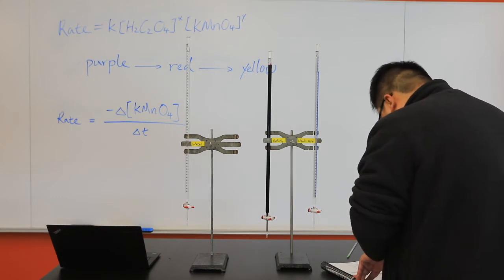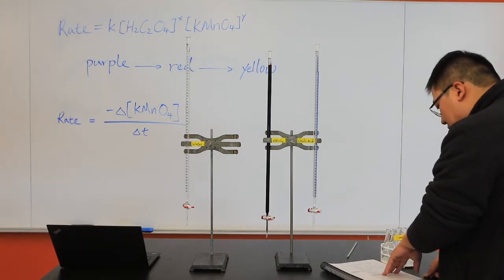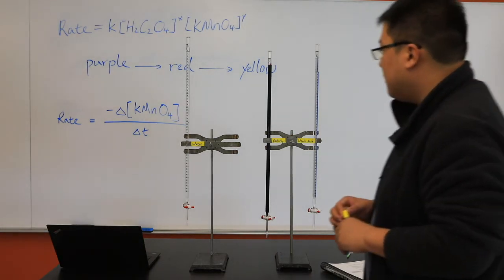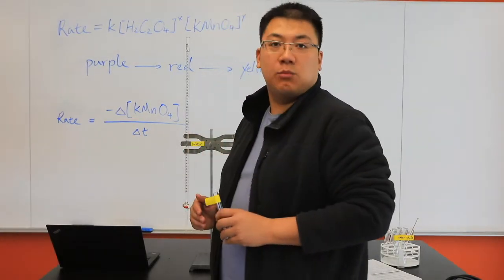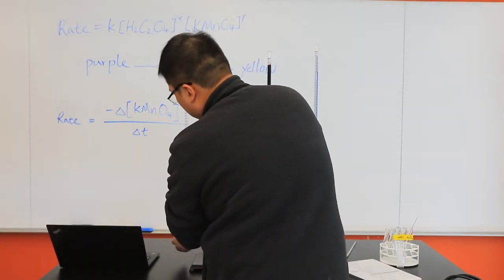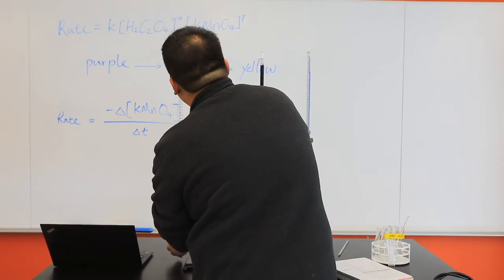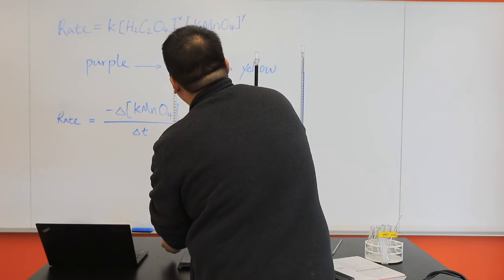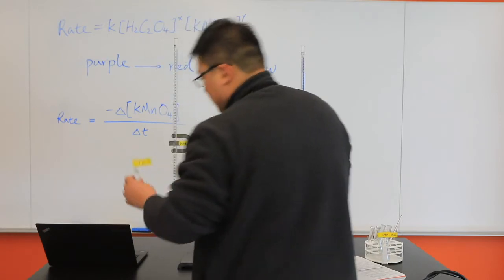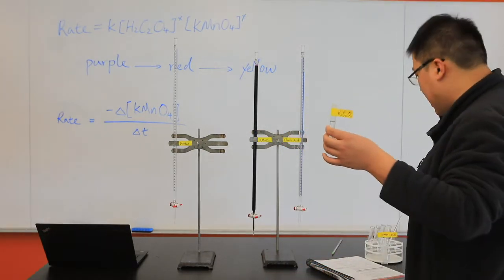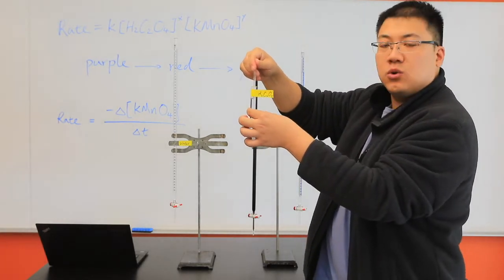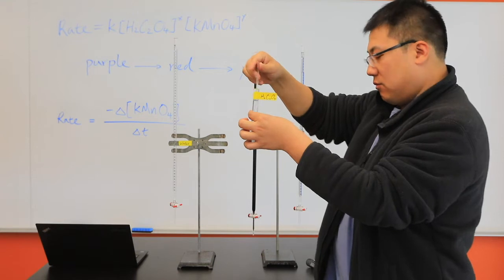Then continue reading the procedure. We want to add 6 ml of the distilled water into the test tube with oxalic acid in it. I have the water burette right here. I'm going to add 6 ml of it. I'm almost there. Just slow it down. So, this is what I have, oxalic acid and water mixture. I'm going to use the stirrer to mix it in the test tube.